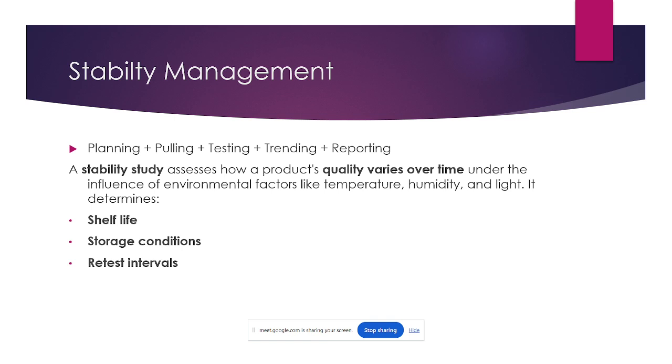In all the conditions, the tablets you manufacture, we need to place in the chambers. After placing them in the chambers, every 3 months we need to perform the testing. Why? Because we are checking how much quality the product has. So every 3 months we test it up to 1 year.